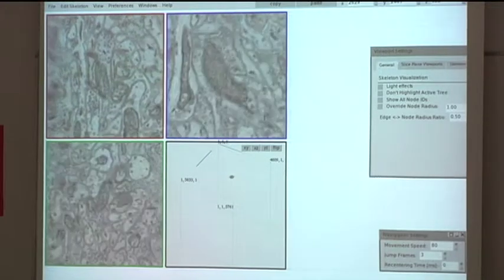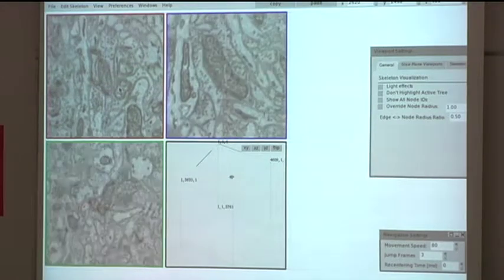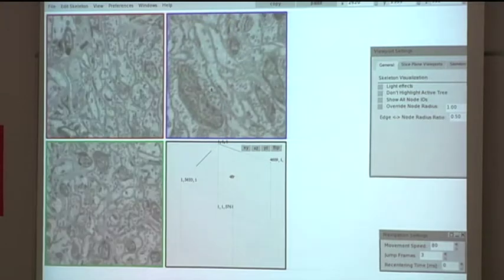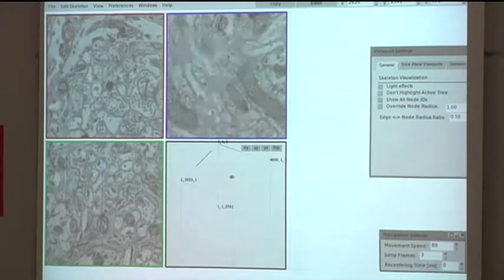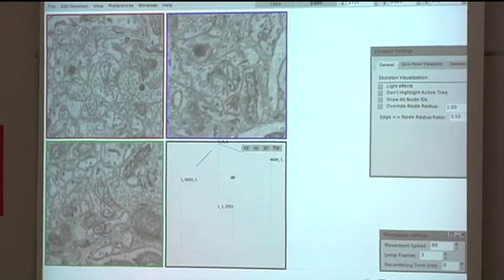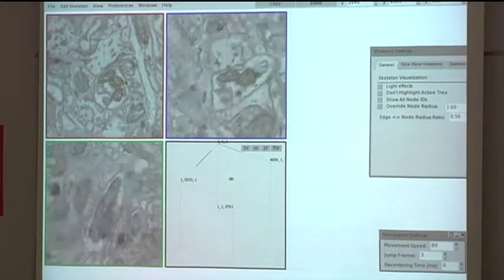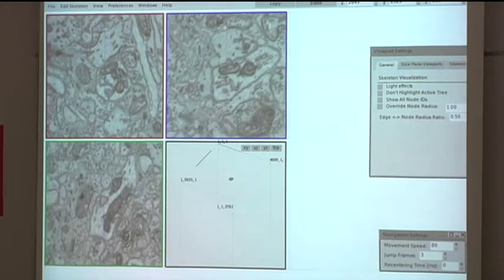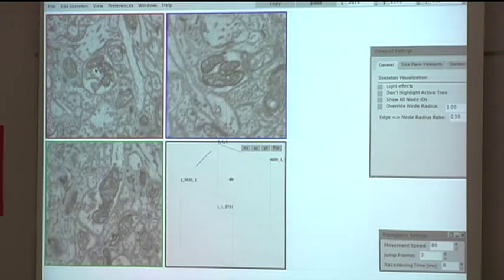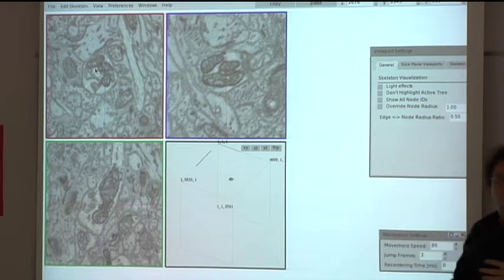So for instance, this one is running for a very long time here. I can see that in the bottom plane. So again, black, weird mitochondrion. So the rule in that kind of data is that anything that looks weird is a mitochondrion, okay? So this is really important to realize. So what is this? Mitochondrion. Take those ugly black things here, 3 mitochondria. 1, 2, 3. I mean, this tells you something about the brain. It's a pretty energy-consuming thing, right? Because that's what mitochondria are there for, and we know that.